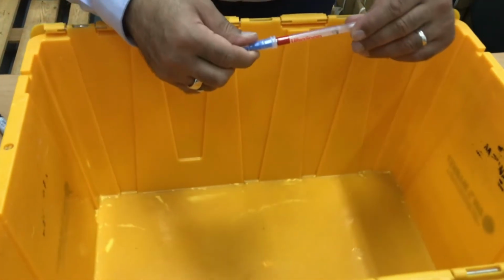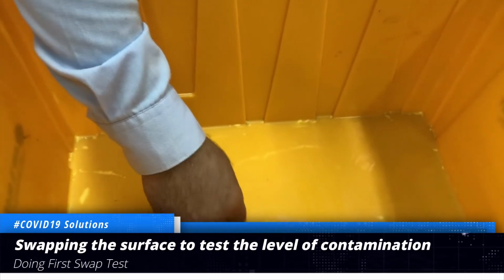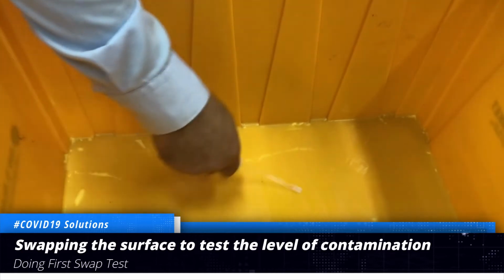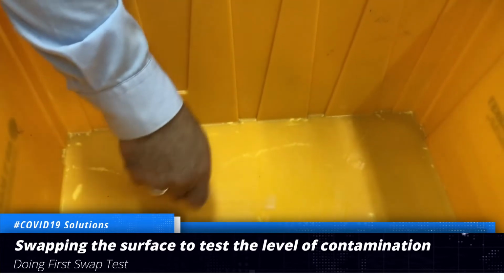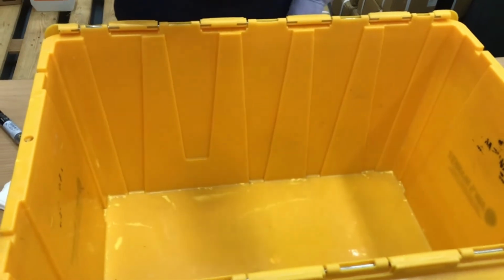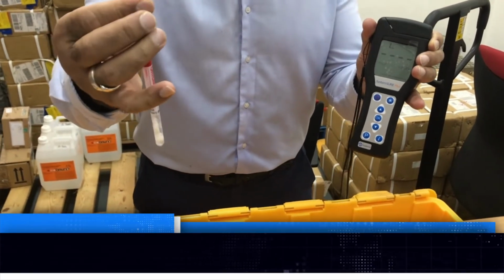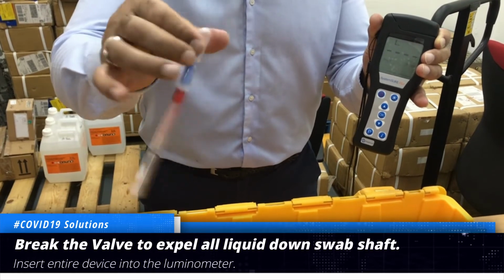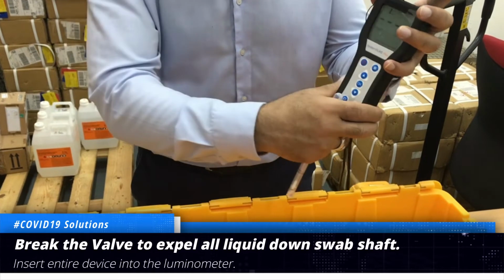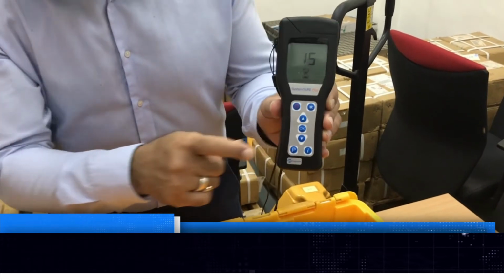Okay, we will start now with the swabbing. Take out the swab, press it, and measure around a 10 by 10 centimeter surface, and the swab should be turned around during the process. Then take it back inside. The machine has to be turned on. Break, push the liquid inside, shake it for 5 to 10 seconds. 5, 4, 3, 2, 1, 0. Open the device, put it inside, close it, let's get started.